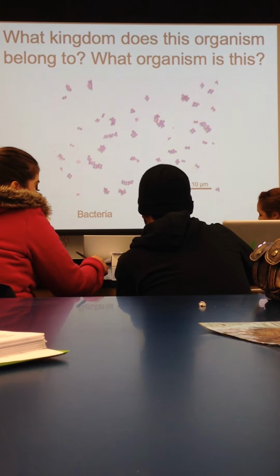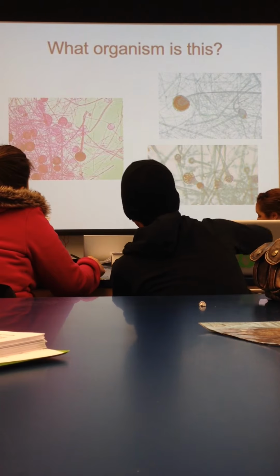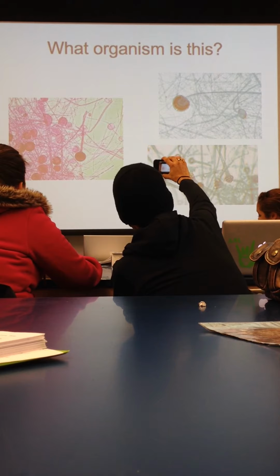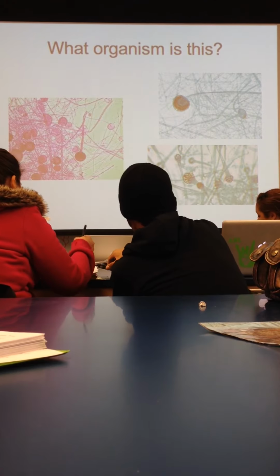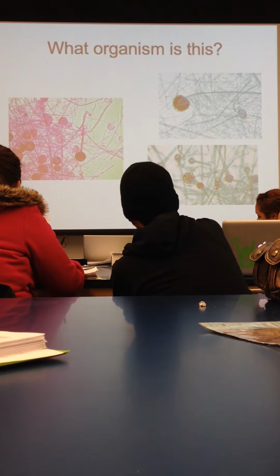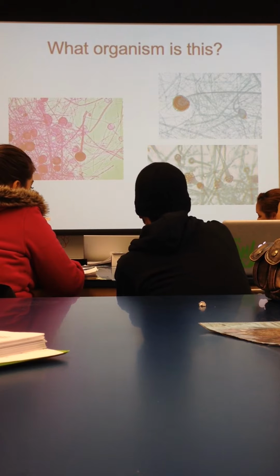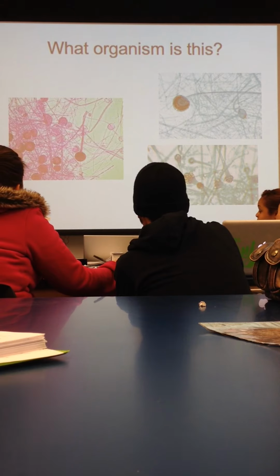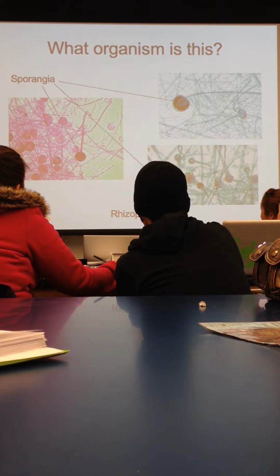All right. What organism is this? It is a fungus. What is it? Yes, black bread mold, and what was the scientific name for that? This guy's Rhizopus.